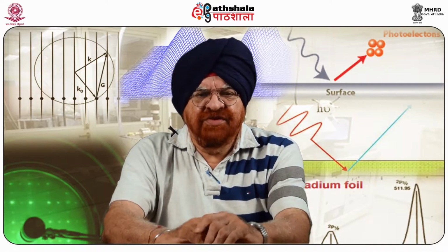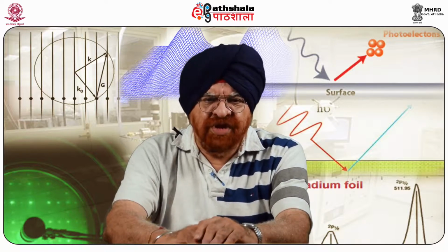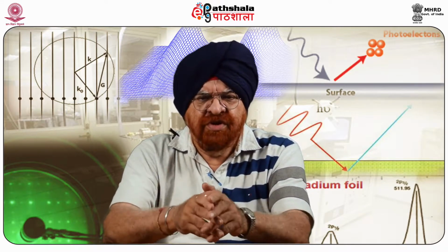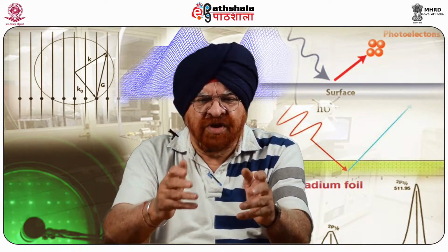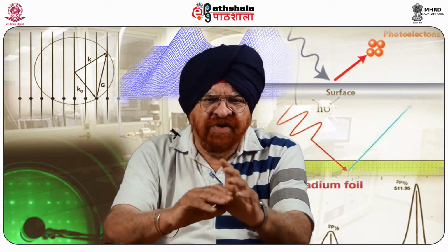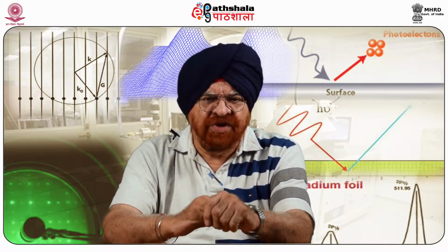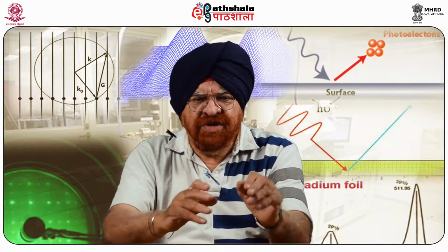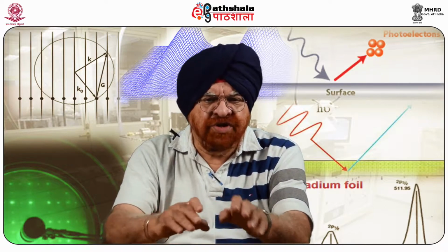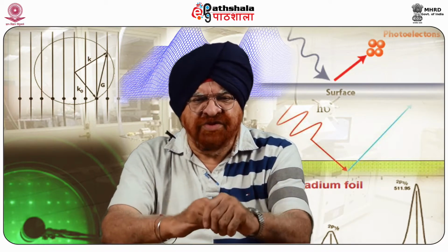So having given the introduction of Kelvin probe force microscopy, which is again a very important surface analytical technique, we are now in a position to explain what exactly you have learned from this module. So if we summarize for your benefit, Kelvin probe force microscopy is a powerful technique to visualize the differences of work function in metals and lateral surface potential distributions in thin organic films or anything that covers the surface.